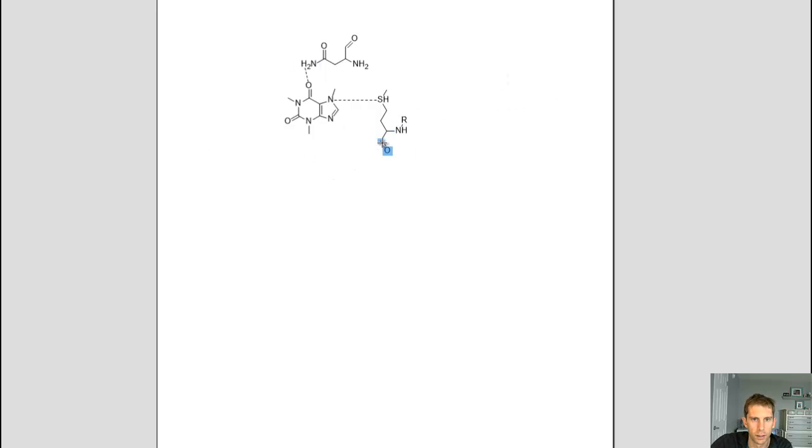And we'll say we've got an NR group right here, so NR. Now this is interesting. So our sulfur is actually protonated. I'm actually going to take this out. So that sulfur is actually not protonated. It's got a lone pair on it. If it was protonated, it'd have a positive charge. I don't know why it automatically protonated when it had this partial bond to it, but we need to edit this, and this is definitely just our sulfur here.